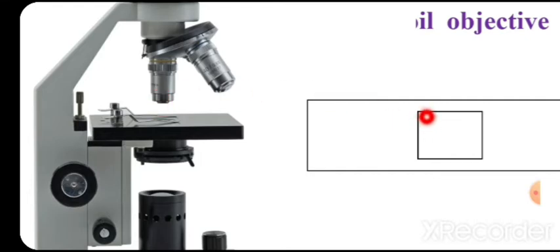So first place a drop of oil here, dip the objective in it, adjust the microscopic field here, and count the number of somatic cells present in one field. Then you have to move the slide ahead like this, in this direction. Now here count the number of somatic cells, blue colored cells with blue colored nuclear material, and record it.